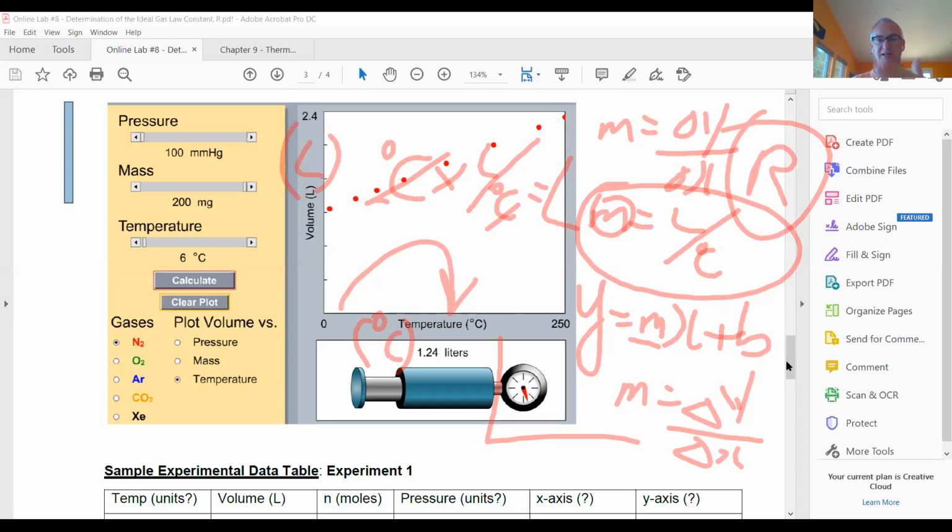So you're correct, this particular line of temperature versus volume doesn't give us R. But when we work out a combination that does give us R, how are we going to know? You plug it in the equation. Okay, yeah, we'll plug it into the equation, but even if we get a number that vaguely looks like R, how are we going to know we're on the right track?